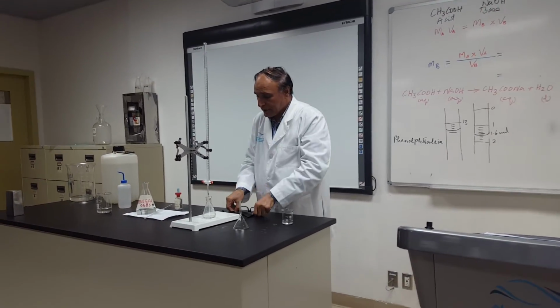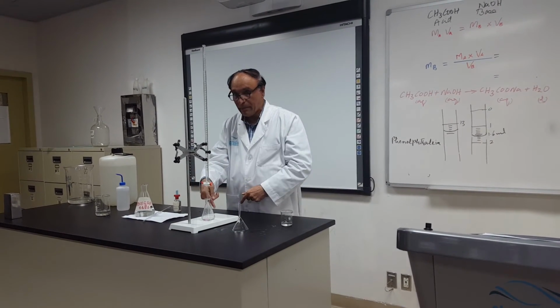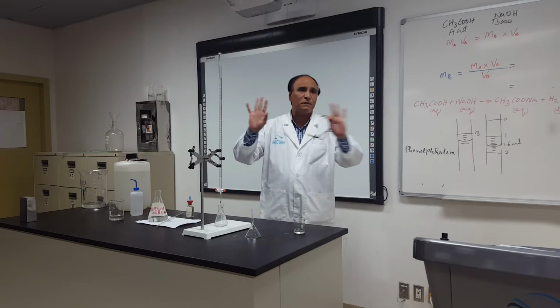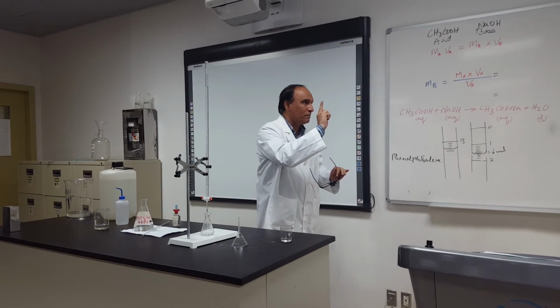Now, you know that as I am adding this one, the pink color comes and disappears. I should not do this experiment very quickly. Otherwise, there is no use in doing the experiment. I should get the pink color with one drop.